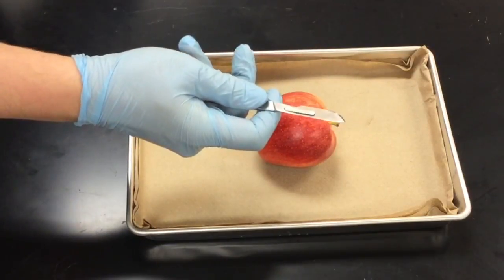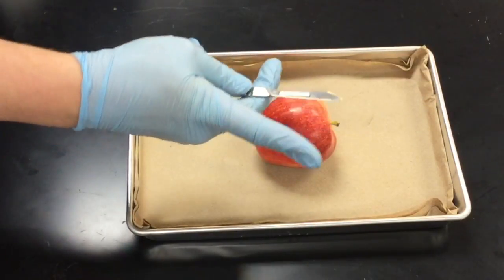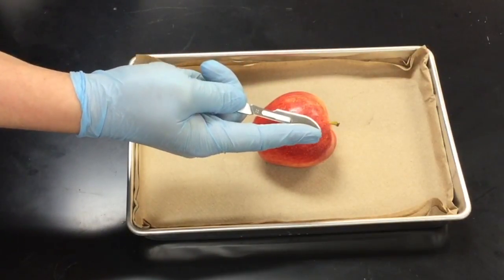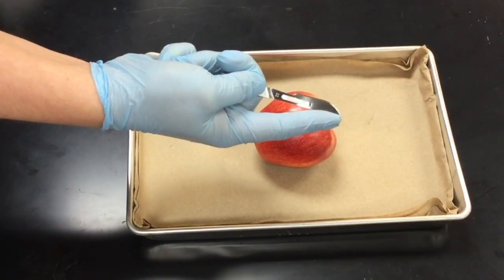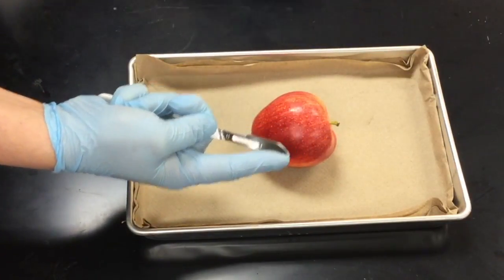Now, you do not want to hold your scalpel like you're going to be sawing or chopping into something. You want to gently rest the scalpel in your hand, taking your pointer or your index finger and placing it over the smooth or flat end of the blade. This is going to give you a lot of control with your scalpel as you are making your incisions into your specimen. So I'm going to demonstrate how to make an incision on this apple.